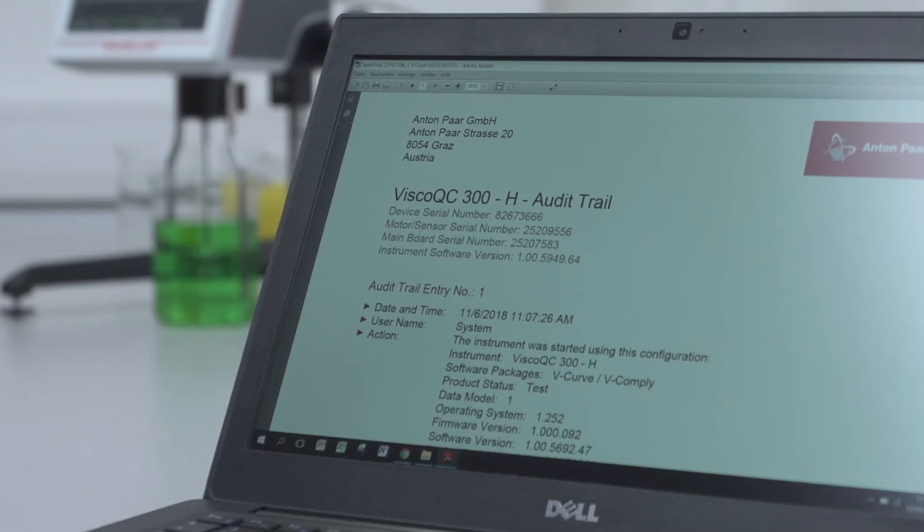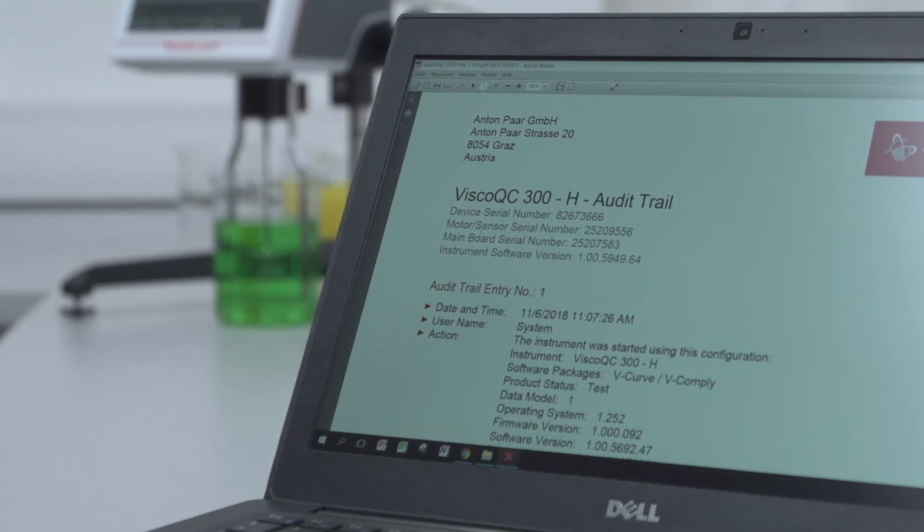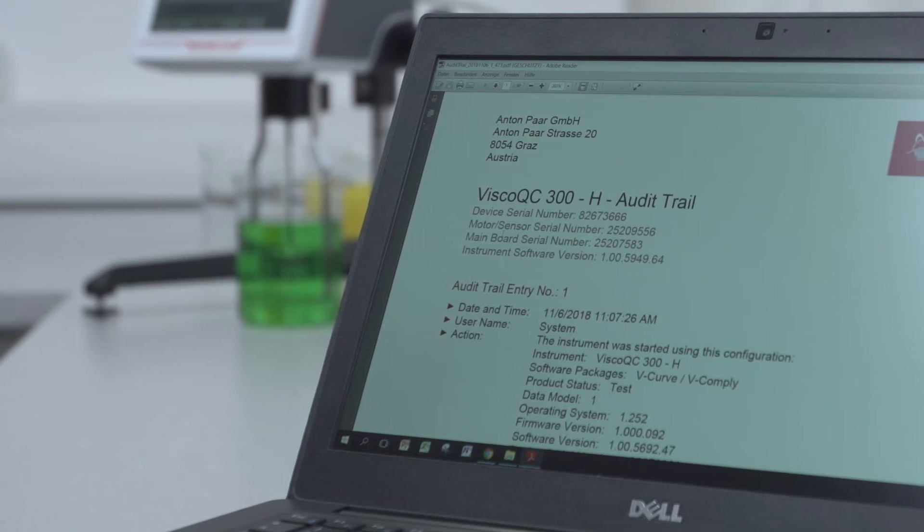To further improve your process, automatically transfer your data to your PC or network with the LIMS Bridge software that comes with every instrument free of charge.